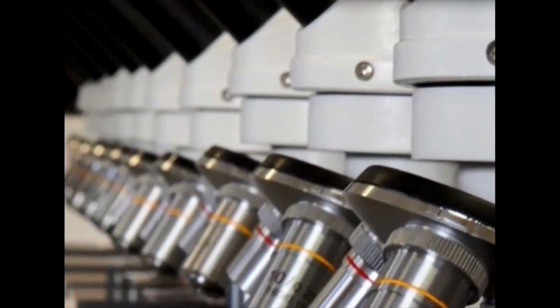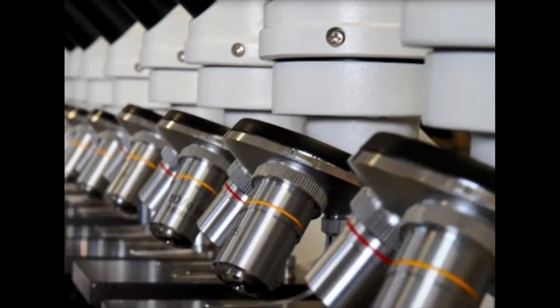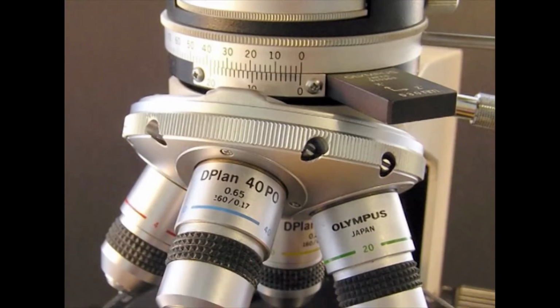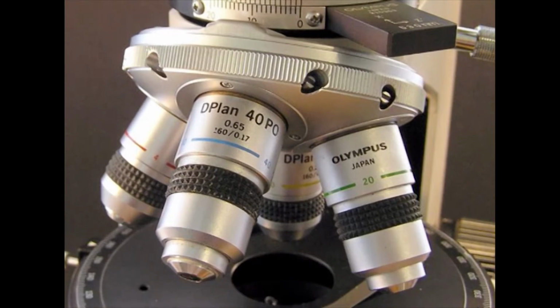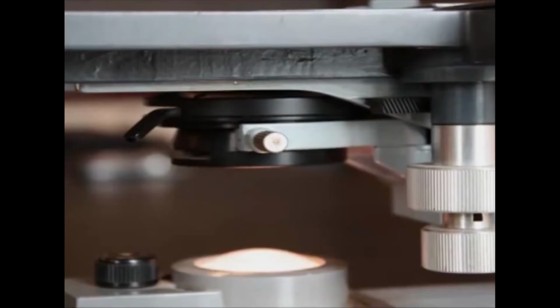The objective. It is the crucial component of any microscope which acts with the ocular to perform two basic functions of the microscope: magnification and resolution. It is also called the object lens since it is nearer the object under examination and is the one that first receives the light from the object itself. It brings the light to a focus in the principal plane of the ocular, producing a real and magnified image.